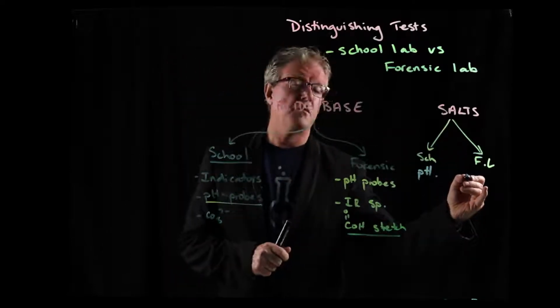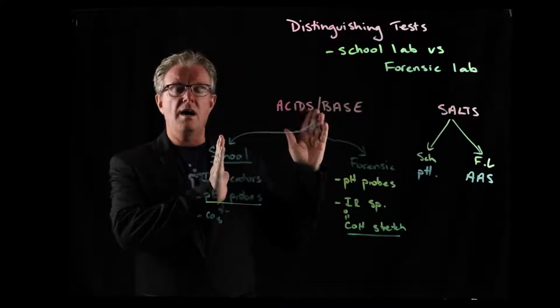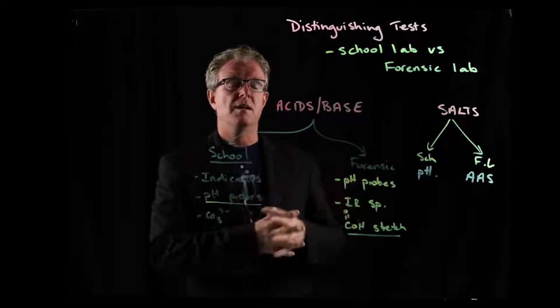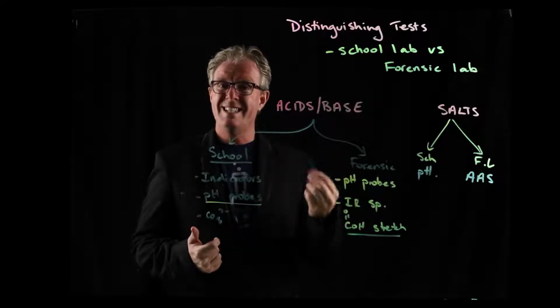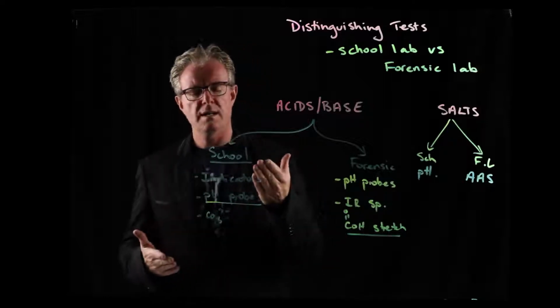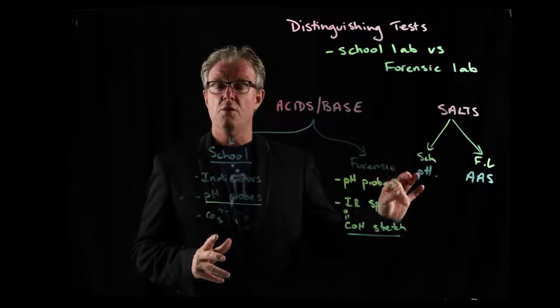In the forensic lab, they will be doing atomic absorption spectroscopy. Okay, so you can see a general trend here. The forensic labs are more machine-based, more non-destructive, quicker, faster, more precise, and also more sensitive than the methods that we use, which are very laborious, labour intensive, time consuming, wet lab destructive techniques, whereas in the forensic lab they have a lot more finesse.